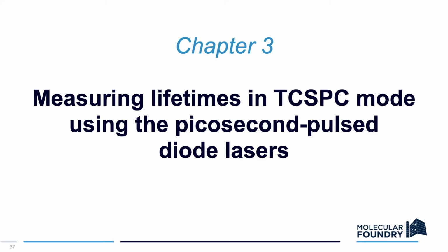Chapter 3. Measuring lifetimes in time-correlated single-photon counting mode using the picosecond pulsed diode lasers.